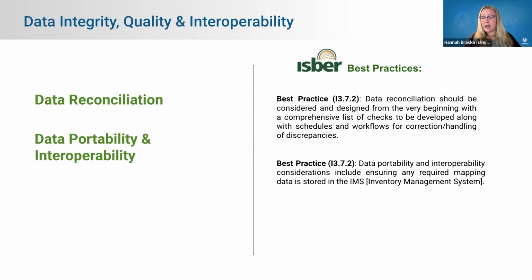And having those workflows within the system, as well as having that data portability and interoperability. So making sure that you're able to get data out of the system as easily as you are to push data into the system. And LabKey has some good tools around this as well.